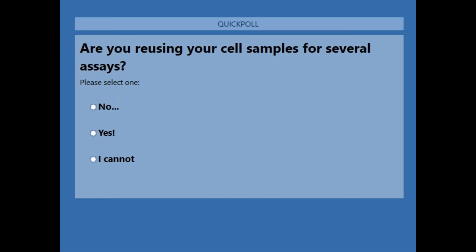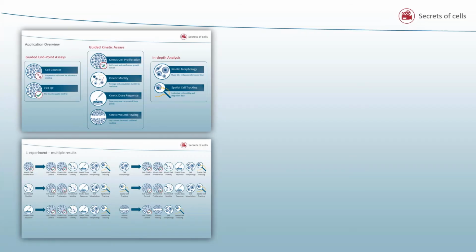Okay, thank you. That's great. A lot of you, almost 65% of you actually, are reusing your current samples. That's really great to hear.